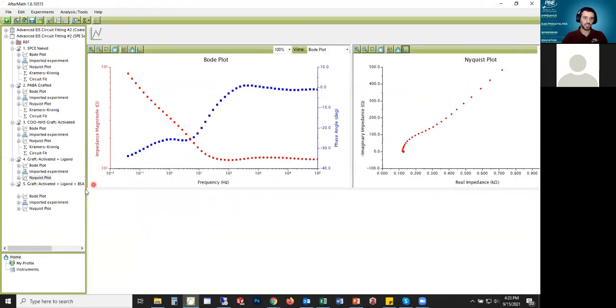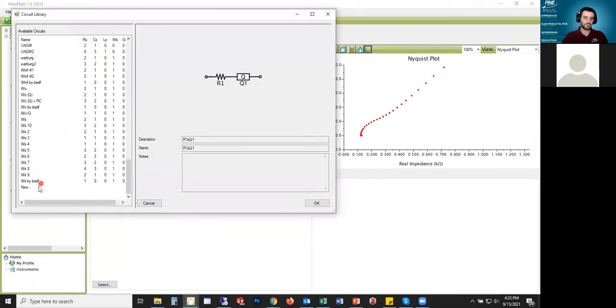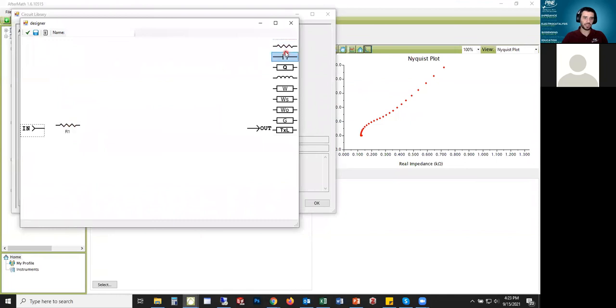So now I'm going to try and fit this data and show you how that works. So essentially what I want is a leading resistor and I want to make this sort of three-tiered element where I have my resistor and my capacitor or my CPE, and then I have my inductor and resistor in series. And then I have a Randalls element with diffusion that's in series after that. So that's why this is a little bit of a tricky model because it's not just this inductive loop kind of model. I also have that Randalls element and diffusional element coming after it, so it's a bit of a complicated model.